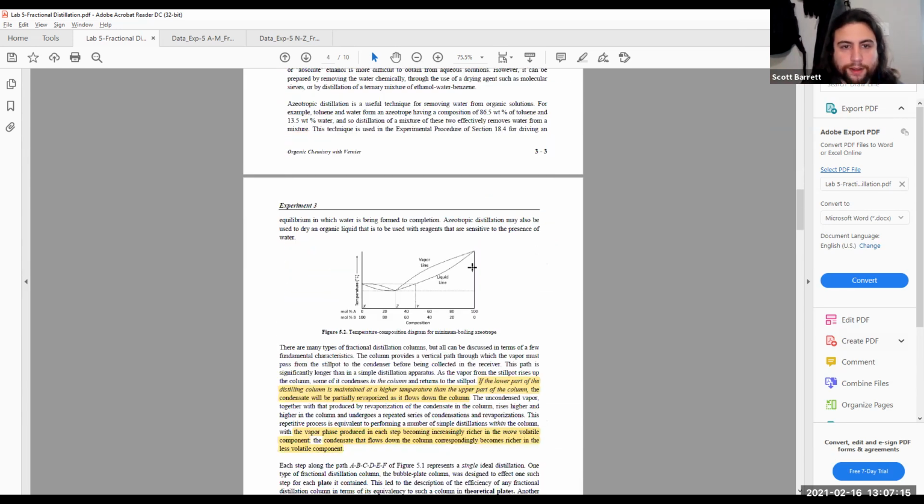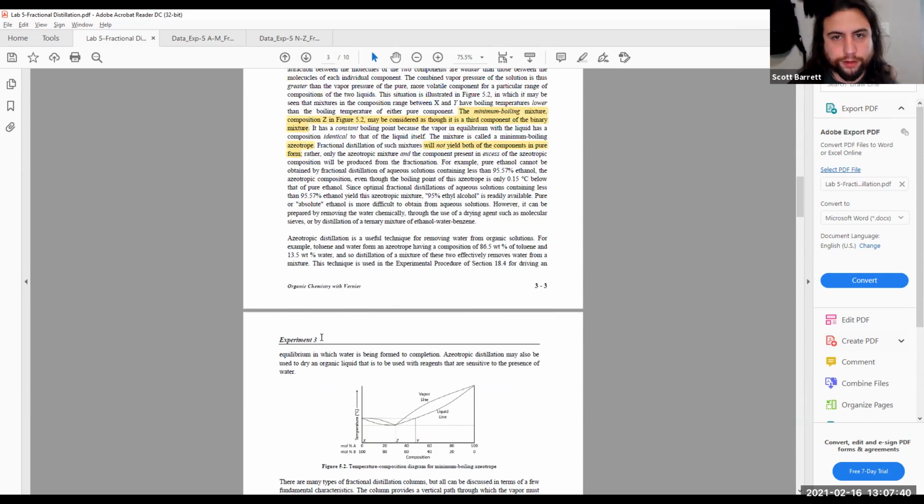In this system, as you boil down and keep going, it comes over here to Y, goes down, and eventually you get down here to Z. Well, what happens? The issue is that it doesn't continue to crawl down. Instead, it actually begins to crawl upwards, and you end up making a more impure solution, an azeotropic mixture.